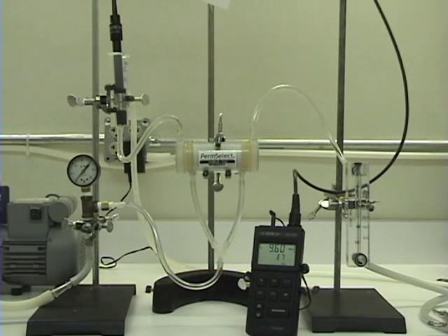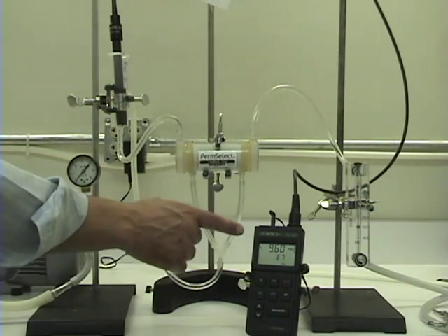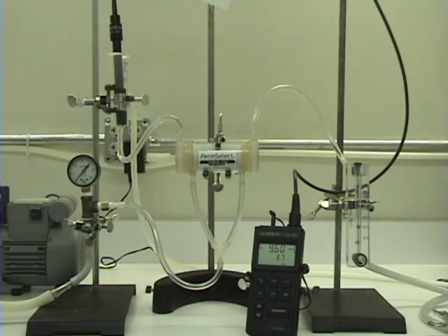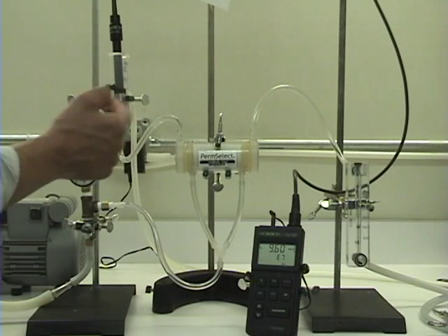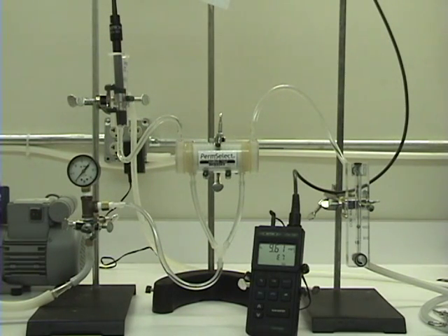Without applying vacuum, the amount of oxygen dissolved in the tap water is shown to be roughly 9.6 milligrams per liter. That is essentially the inlet conditions to the membrane module.